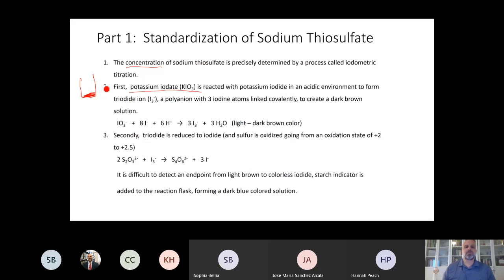This allows you to have a solution you're starting with. If you think about the sodium thiosulfate solution, water molecules can evaporate away, and we see changes in concentration occurring just from evaporation and the like. Whereas when you weigh something out, you have a known quantity. It's not evaporating. The quantity is what you weigh, and you can calculate how many moles there are.